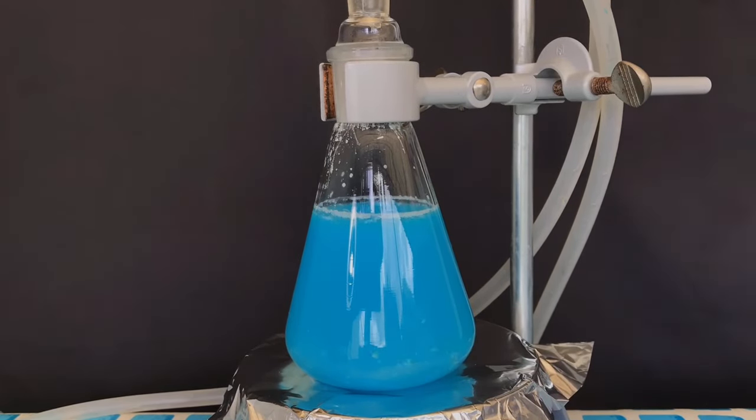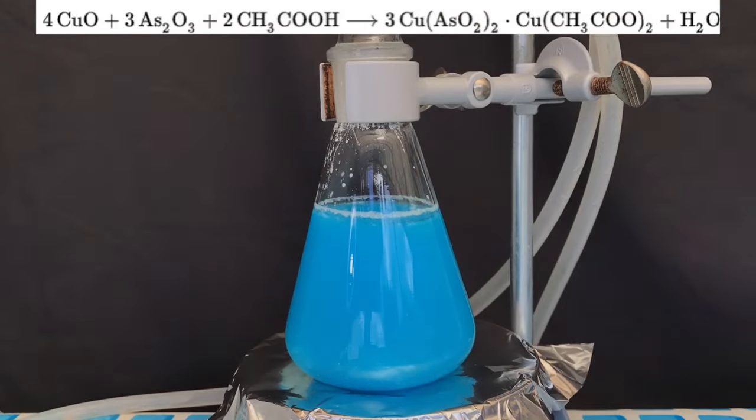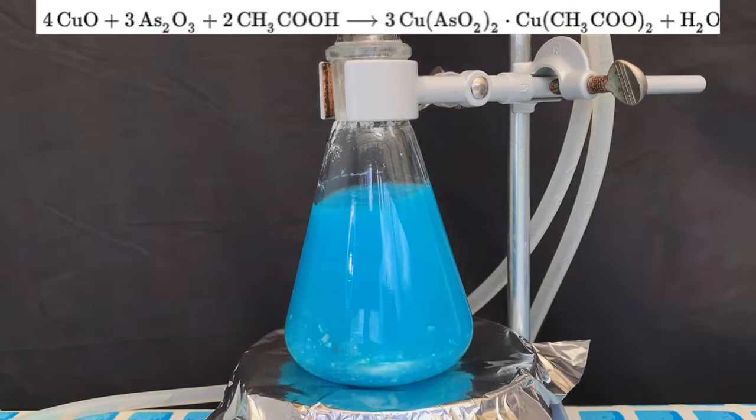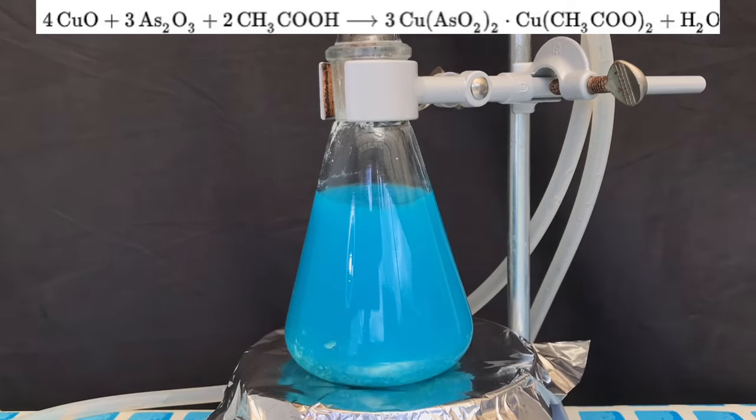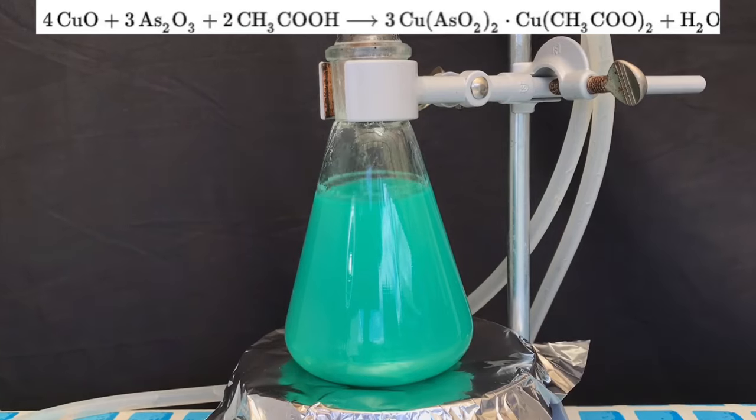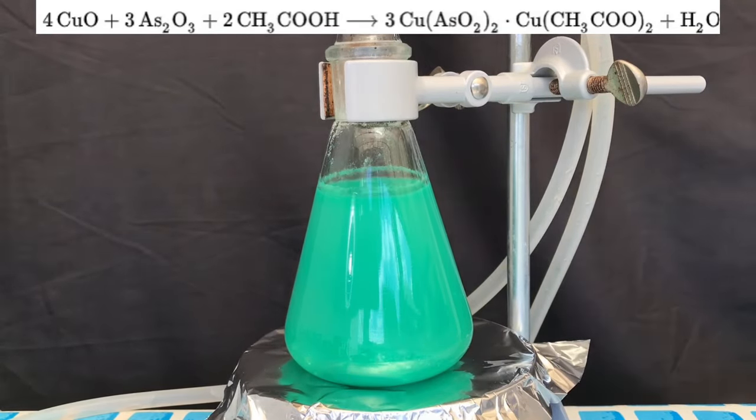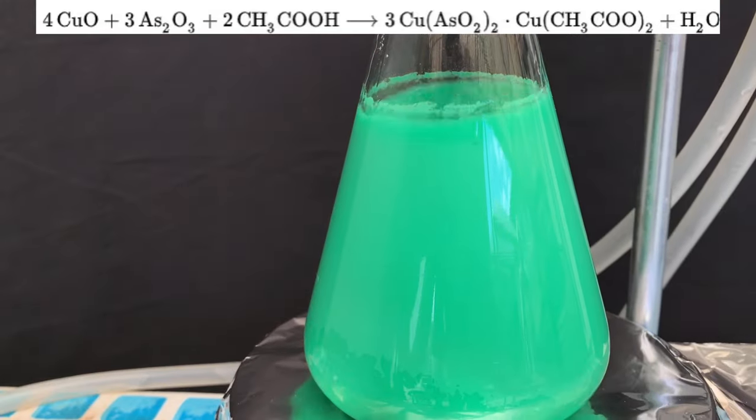The contents were refluxed for exactly 1 hour. The entire reaction taking place looks like this: Copper oxide, arsenic 3 oxide, and acetic acid form Paris green and water. We split the reaction up and therefore needed to use more acetic acid. Our formed copper acetate would react in the second step to form Paris green, water, and acetic acid.